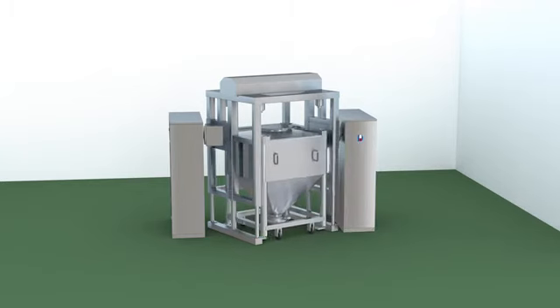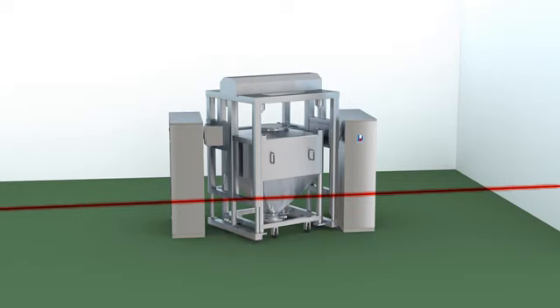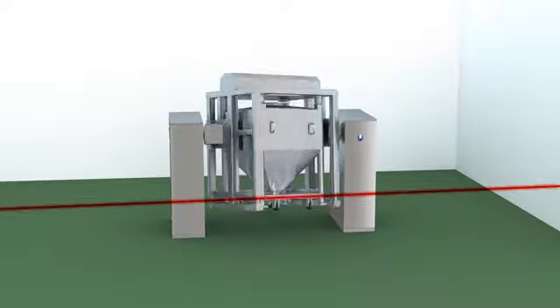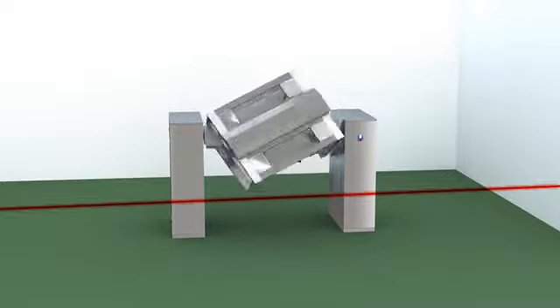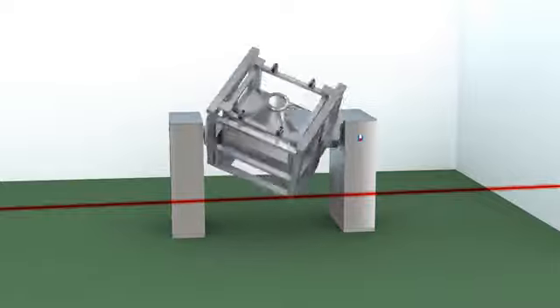Operation Flow: Push the loaded hopper into machine body and start control system and infrared device. Begin clamping and lifting hopper. After hopper is clamped and lifted well, machine begins working according to the preset blending cycle and time.